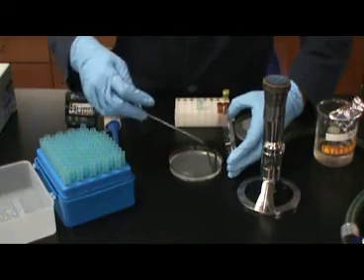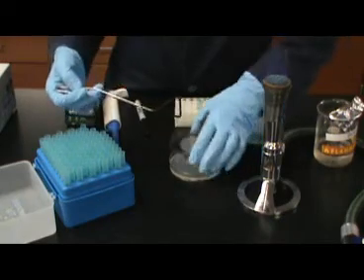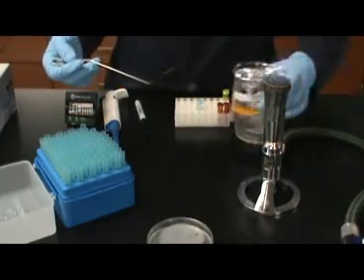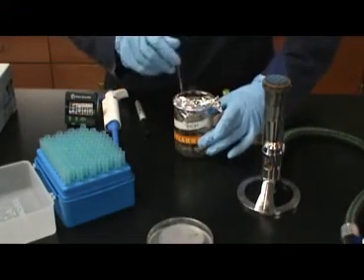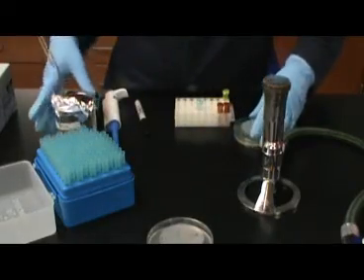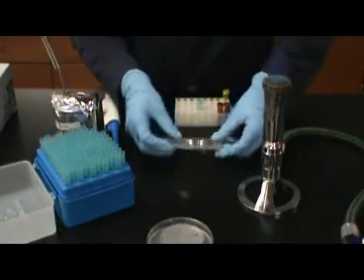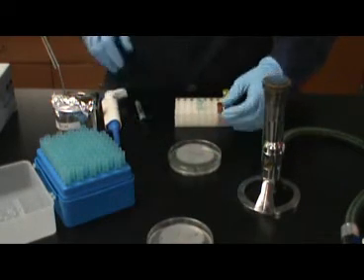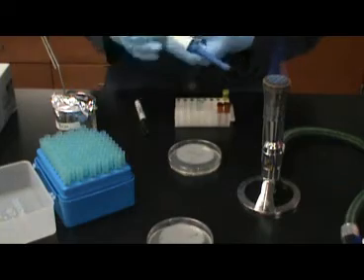Once the spreader bar has cooled, you are ready to begin spreading the bacteria. Use the spreader bar gently. Do not push down or put pressure onto the agar, and make sure that the bacteria is spread evenly across the plate. When you have finished with the spreader bar, replace it directly back into the alcohol. This same process will be repeated for the positive DNA plate using the positive tube.